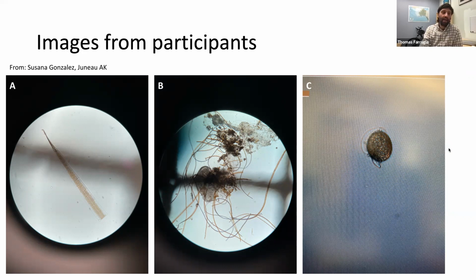All this is obviously assuming you're already at a microscope and you've already put things on a slide. There's a lot of training that goes into that as well, and it's better done in person or in smaller groups. So this wasn't the point of this workshop. This was just, once you're looking at things under the microscope, to give you a little indication of what you might be seeing and help you out there.